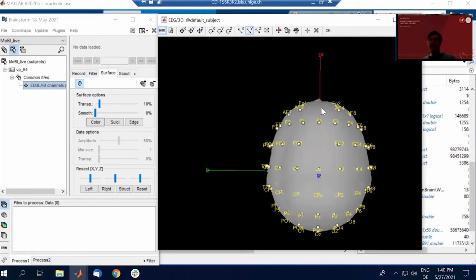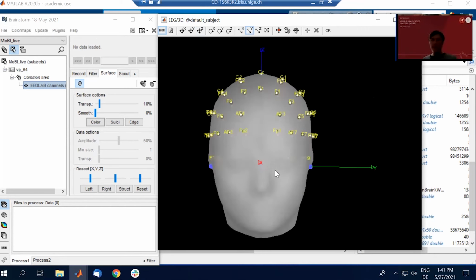What is important to check is that this axis is parallel to the X-axis. There is no shift, no tilt in either direction. So you can just check that through here. And this should also be symmetric, so to say, but this is already all right.